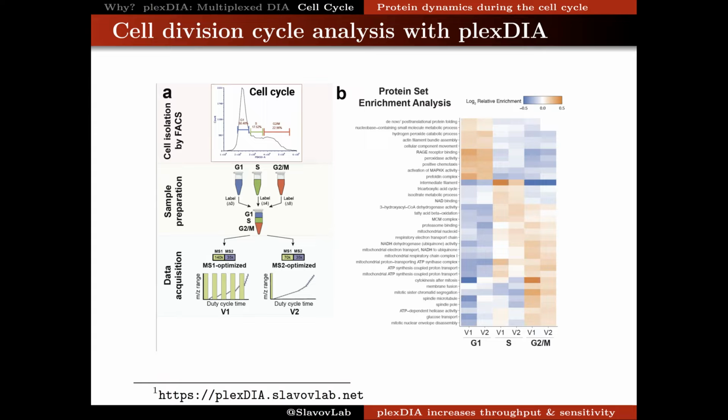For us, that's a technical detail, because what we're really after in this case is the concept of increasing the throughput by using non-isobaric labels, while we think that there is the potential of achieving even better results by using other types of non-isobaric isotopologous labels. So this labeled set was analyzed with two different data acquisition schemes.